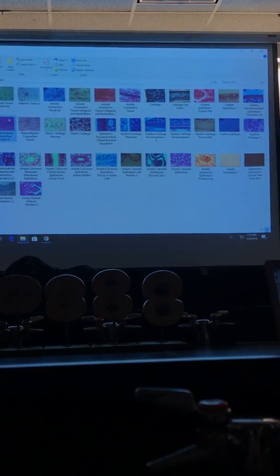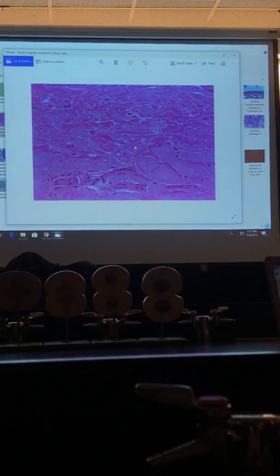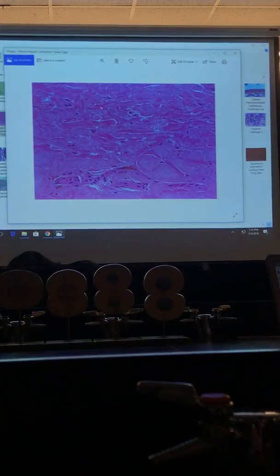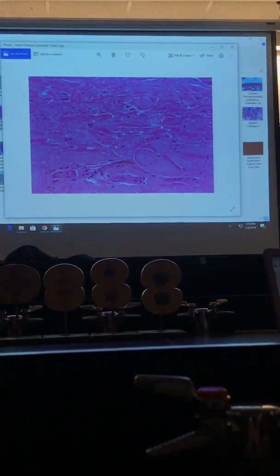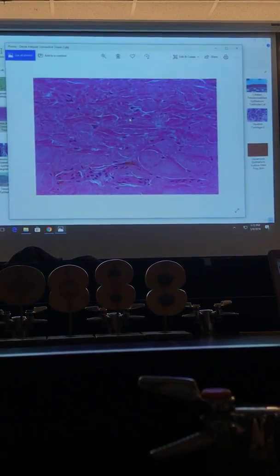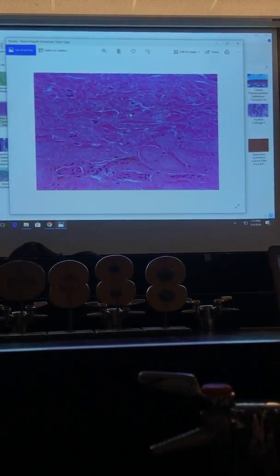And I don't think this is a good one. Oh yeah, it's okay. This is DICT. This is actually deep dermis. So if you look at slides 10 and or 11, and I'll do that in a minute, you can see how it's not regular? So it's this whirly swirly appearance, like maggots. This is the deep dermis, also known confusingly as the reticular layer of the dermis.